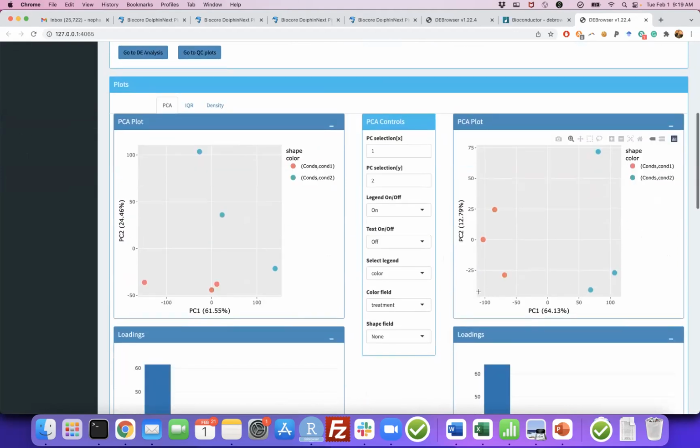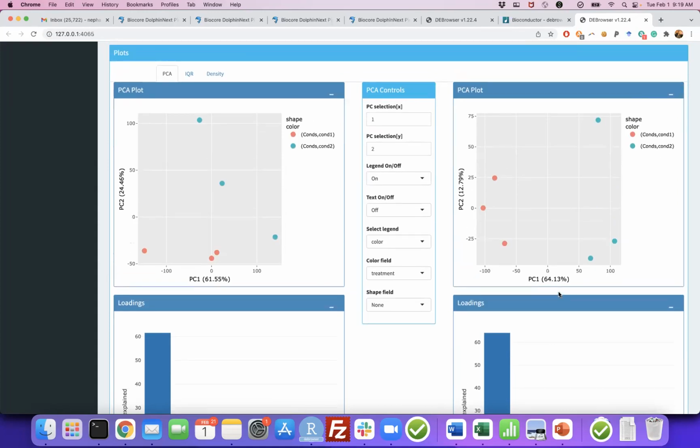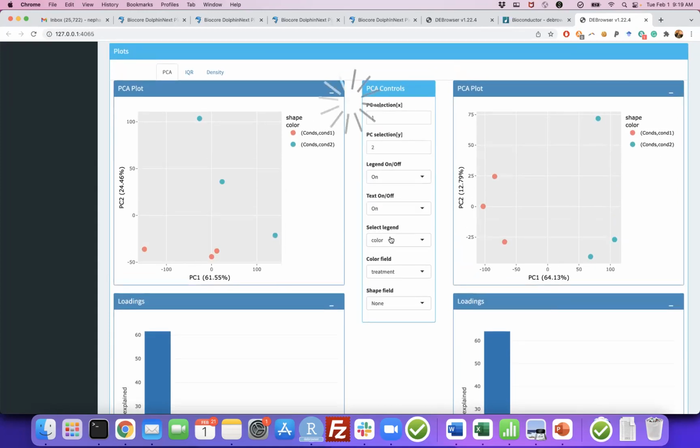So it's doing something, but this is not a real batch effect. I just chose the farthest point here, but there is no batch effect problem here, but still it is doing some correction. You can tell that it was 61% in PC1, explaining the variance in these two different conditions. In this case, 64. So it is doing something interesting here that you can tell. There are other things you can do. You can put the controls here, like experiments here. You can put the sample names on it, and it's not perfect, but at least you can see what they are.